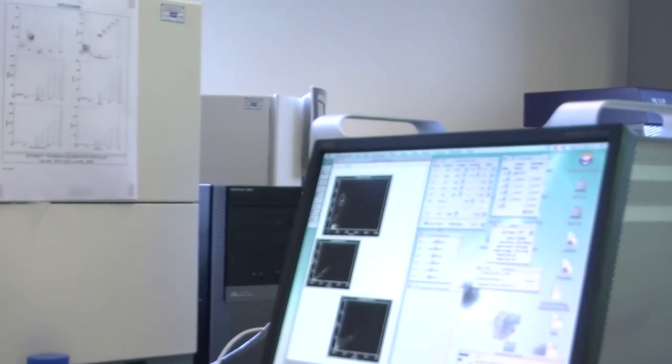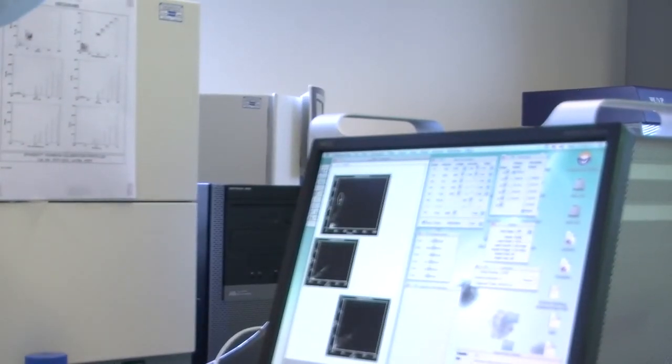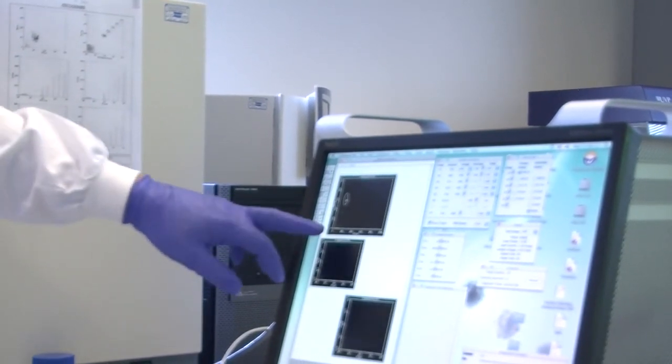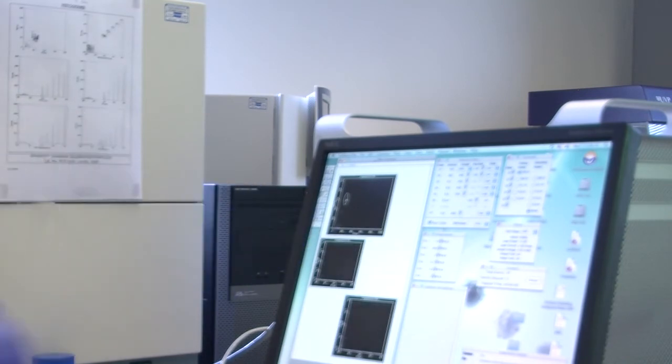Let's just pause, run, restart. So I'm just running the water through again. And we see some events in the bottom left corner. These are very, very small, very, very non-granular. So these effectively are debris, rubbish, bits of cells, flakes of plastic, whatever. There's a few carryover beads, giving us fluorescence. I'm not too worried about those.